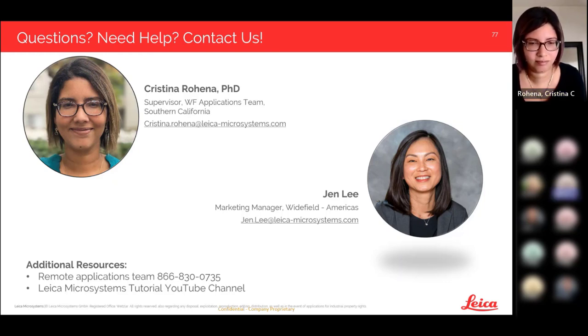An Aivia related question: how can I get a trial license for Aivia? Again, contact either myself or Jen Lee. We can get you in contact with your local account manager, and they can facilitate getting you a trial license of Aivia so you can try it out and have a more in-depth conversation as to how Aivia is better suited to your particular application needs.